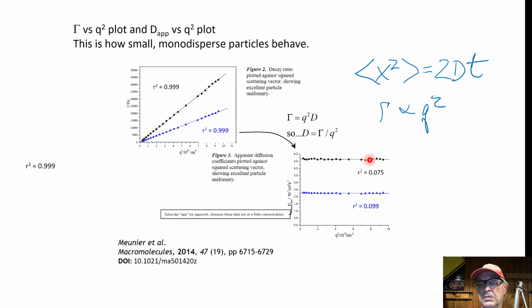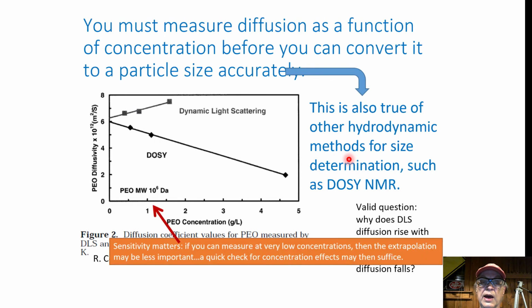Look, it's completely independent of Q. Look at the correlation coefficient. It's independent of Q. I could pick that Q. I could measure maybe that's 90 degrees. This one corresponds to 25 degrees or something like that. It would not matter. I have any angle I want. I could pick one arbitrarily, but very few systems really do that.